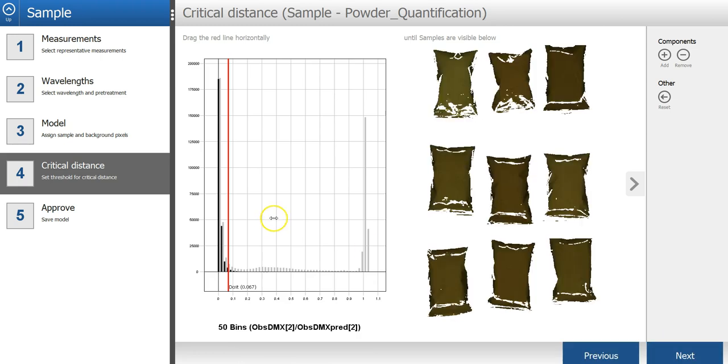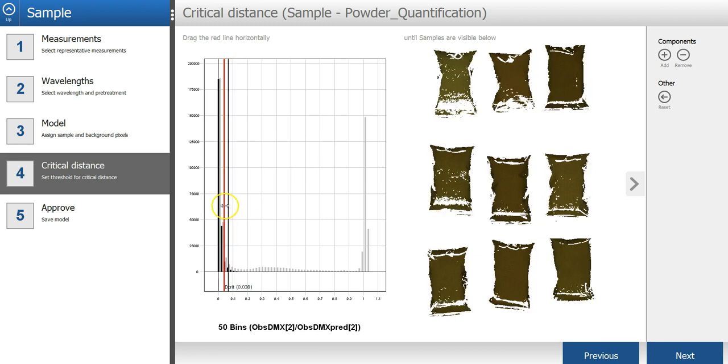In the next step, I will set the critical distance to the sample model. That will be used to determine if pixels are sample or not in new images. To do that, I can drag this red line to the right to move the threshold.